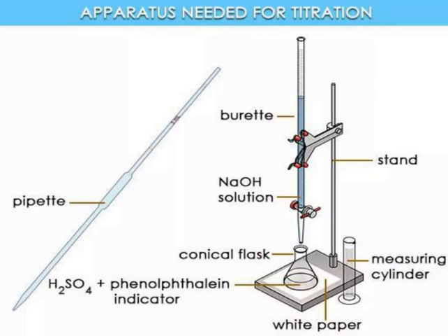If you enter the chemistry laboratory, first you have to arrange all these glassware on your bench. Your bench should be tidy and clean. You have to be in proper dress, like you have to wear an apron and safety glasses, wear your shoes, and your hair should be tied, and all the glassware you are using to perform this experiment should be clean.